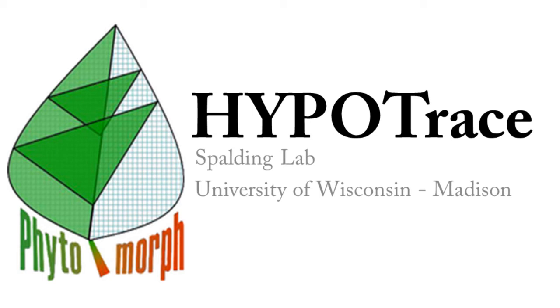Hypotrace is the University of Wisconsin-Madison Spaulding Lab's solution to accurate automated seedling hypocotyl growth measurements. This application can be used for a variety of different types of experiments, such as photoreceptor function studies or hormonal signaling studies.